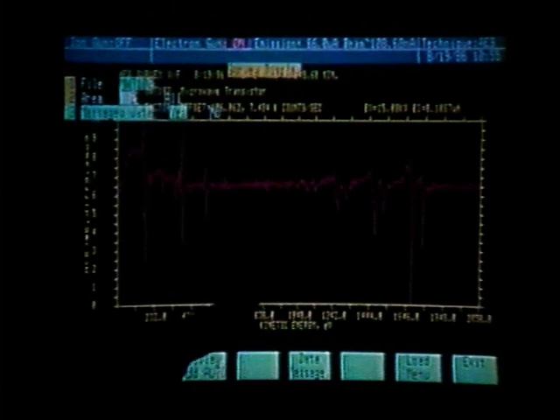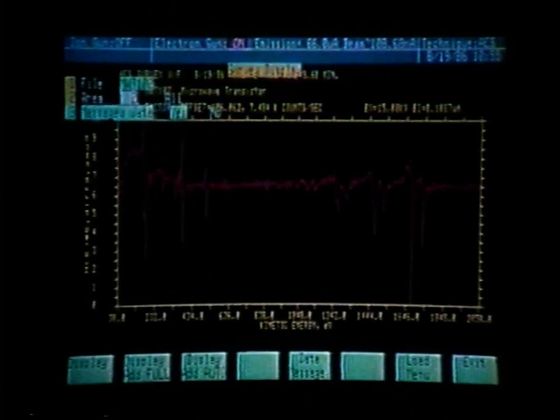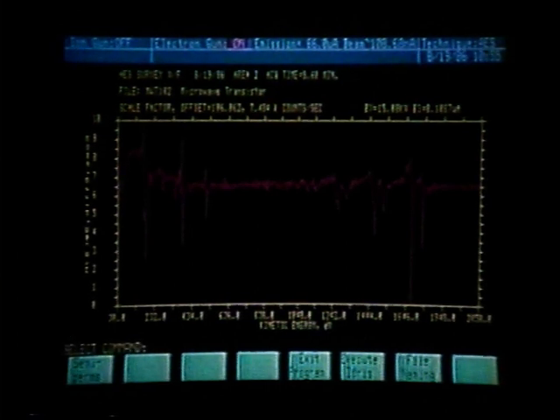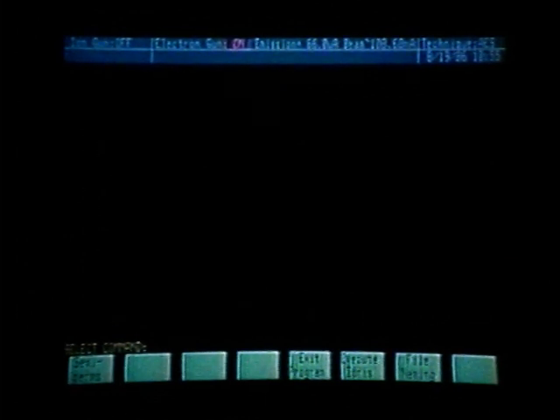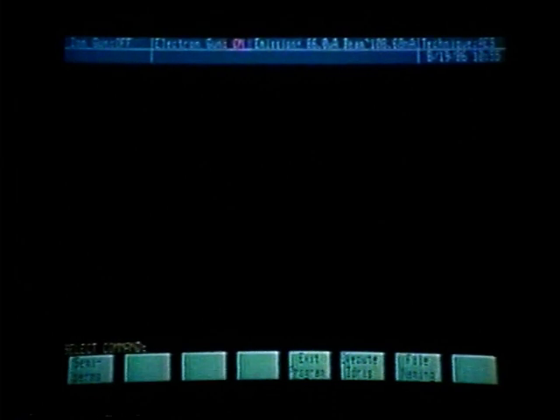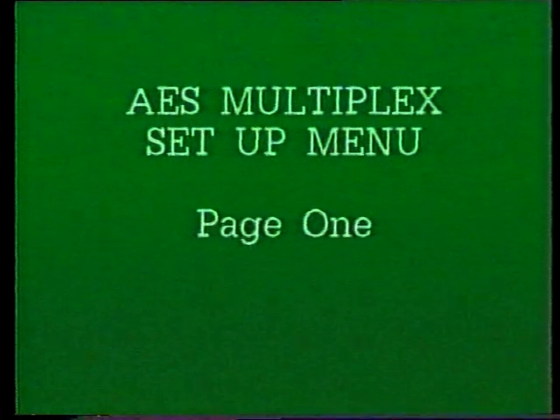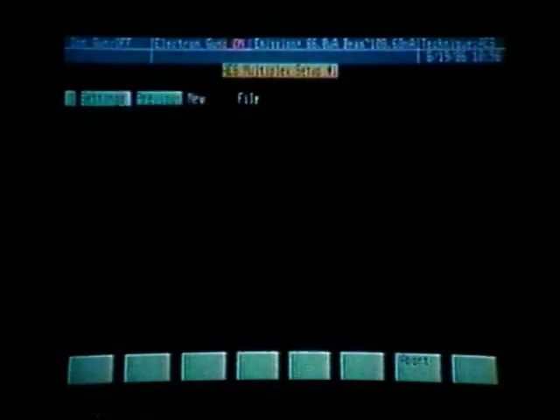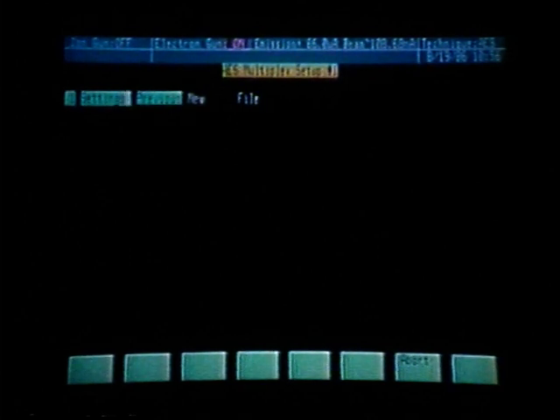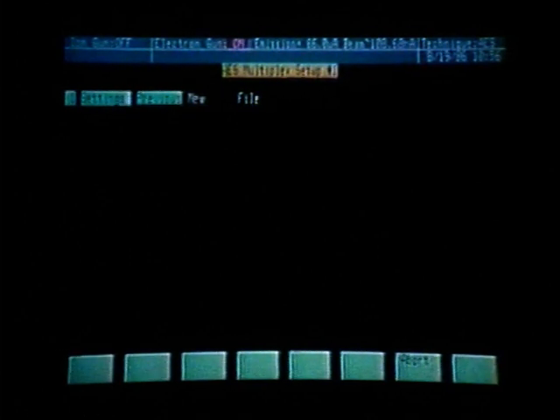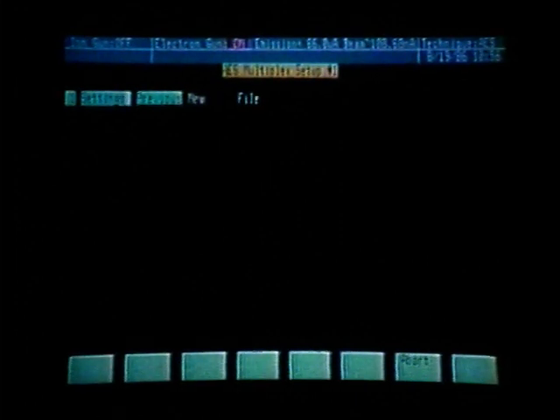Now that we've determined that from the survey scan, let's exit this mode by using soft key number eight. Let's erase the data by holding the control key down and striking the clear key. We're now ready to set up for a multiplex. We'll hold the shift key and press function key number six, which is set up multiplex. Again, we can choose either to use the previous settings, define new settings, or if we have a file on disk, toggle to file, enter that file name, and all of those settings would automatically be set up.